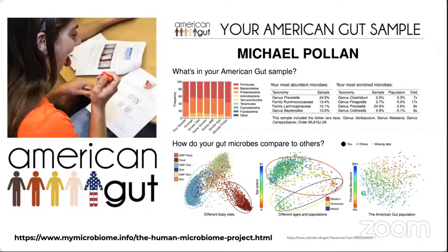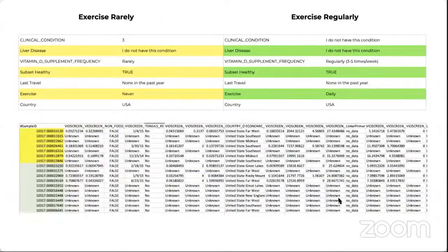In general, this is the data that we have from these publicly available resources. So we can leverage the gut samples, and several samples and the abundance levels of these microbes. These abundance levels can be related to, as I already mentioned, people under different clinical conditions, like those who exercise regularly and those who exercise rarely.